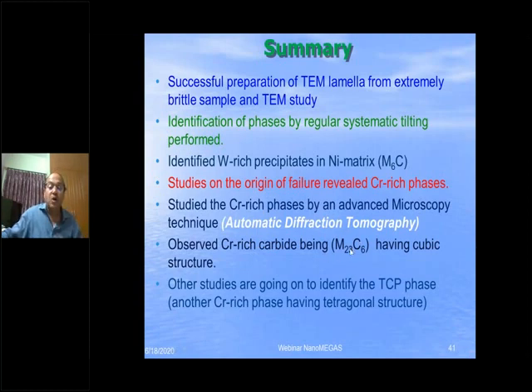So then we find out from the crystal structure analysis. I'm not going into the details, as I would require a full hour to explain how I did the analysis. This is M23C6. So this sort of conclusion can be drawn using this sort of technique.